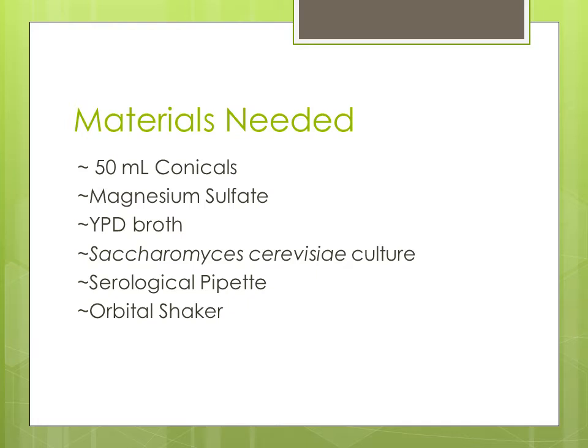The materials needed for this experiment are 50 milliliter conicals, magnesium sulfate, YPD broth, Saccharomyces cerevisiae culture, serological pipette, and orbital shaker.